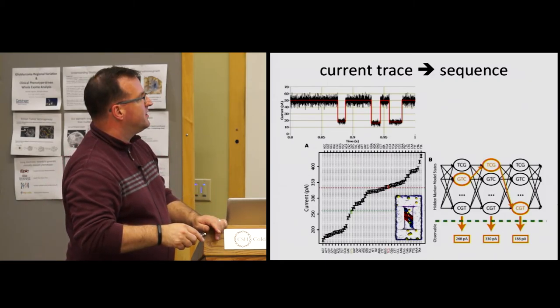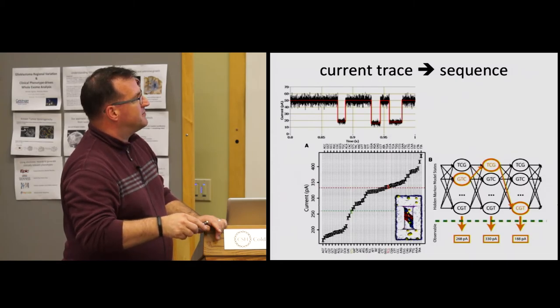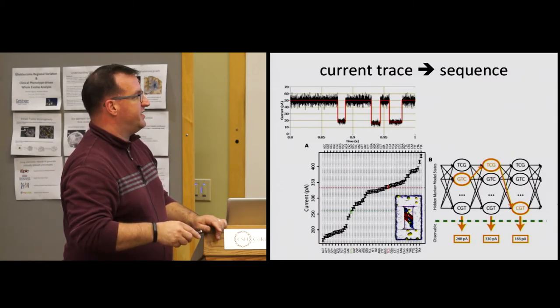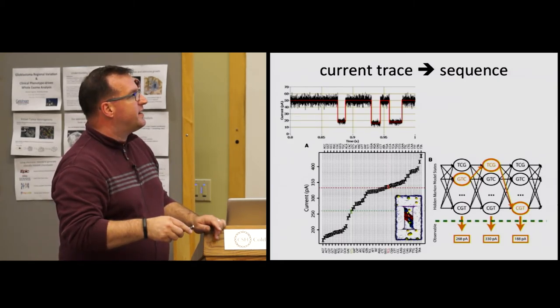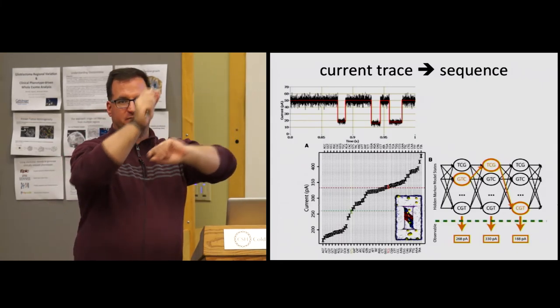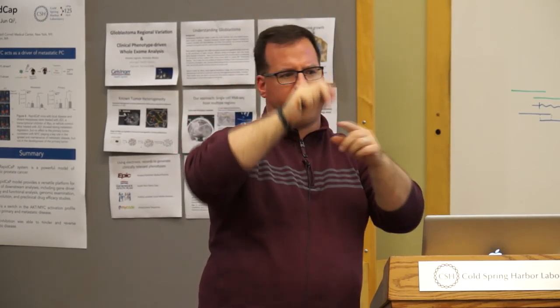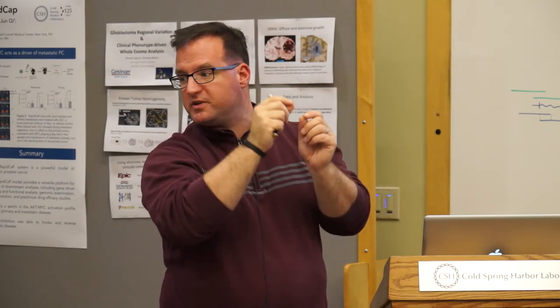And then as I go from this spike to the next spike to the next spike, I can essentially find a path where I say, oh, well, the most likely one of these three was actually the GTC, because the next most likely one is the TCG, and those two are compatible with each other. Remember earlier today when Bill had the path graph, and he said we could go this way, or we could go this way, and if we got here, what are the various ways we could have gotten here? And you did plus ones and minus twos, and you used scores to figure it out. Same thing here, but instead of using scores, we can use probabilities.